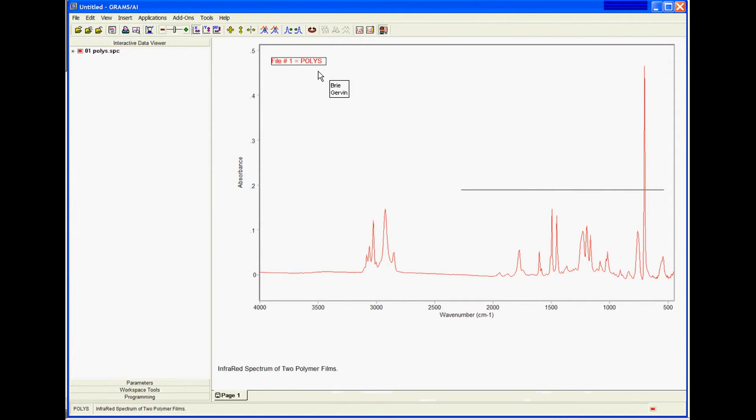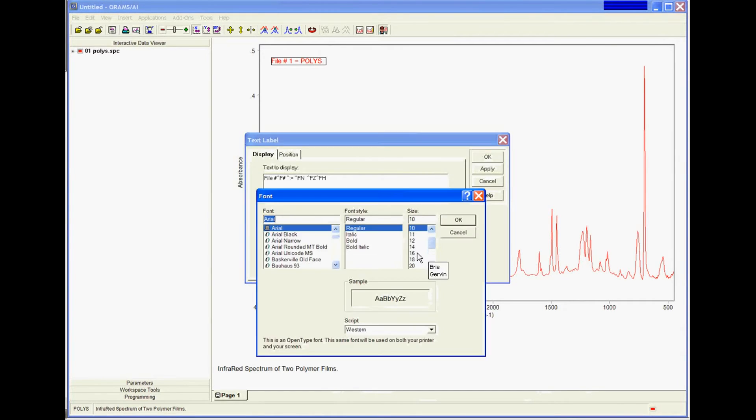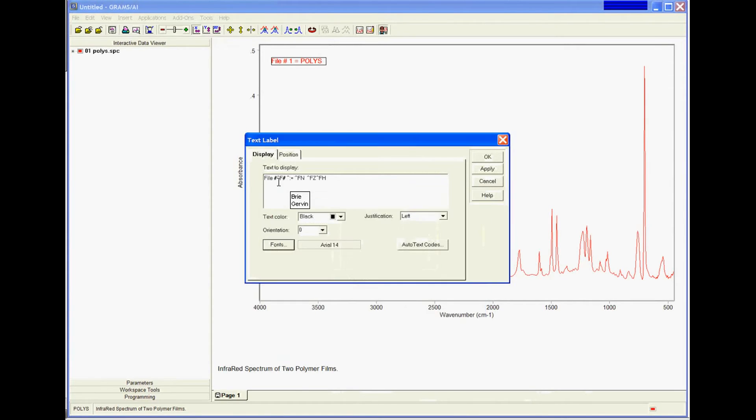I'm going to right-click to modify it. I'm going to make this font a little bigger so I can see it better. I just want it to have the file name.